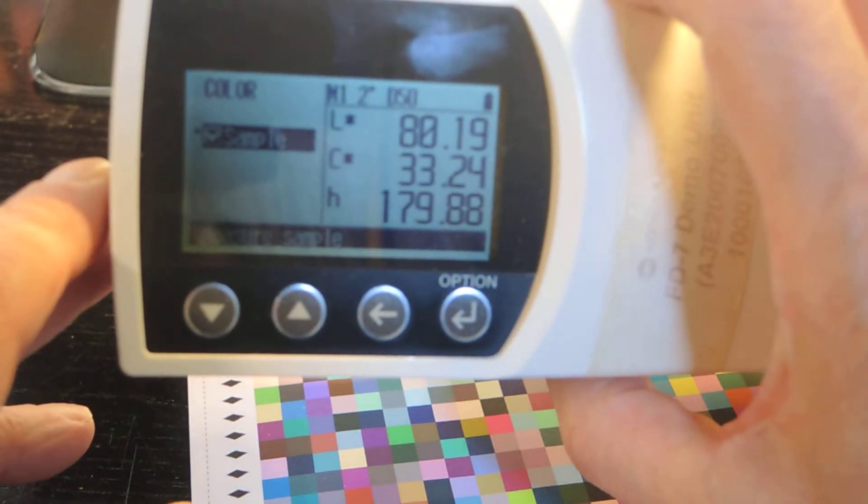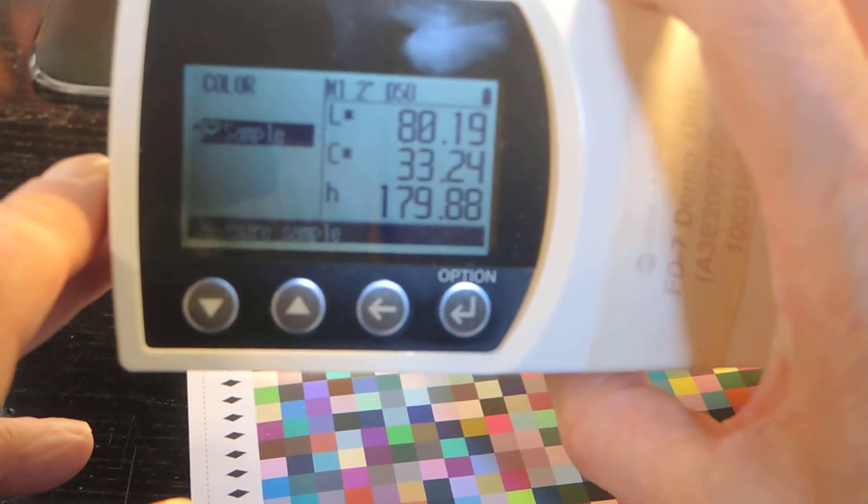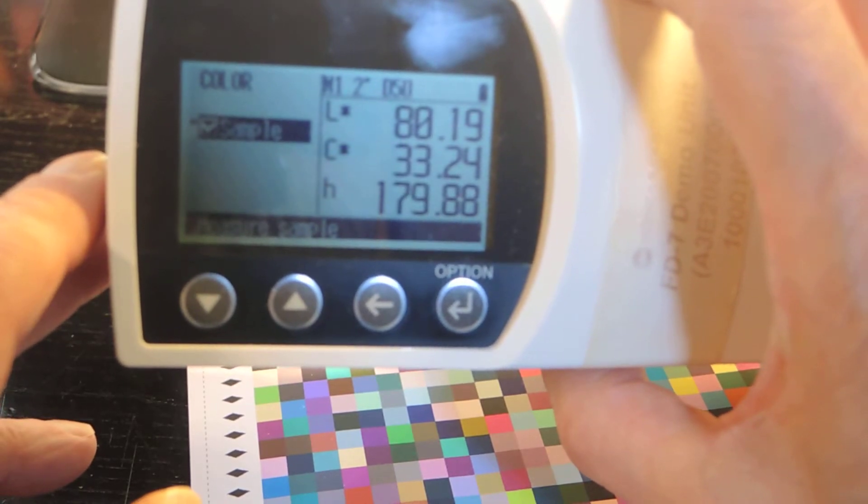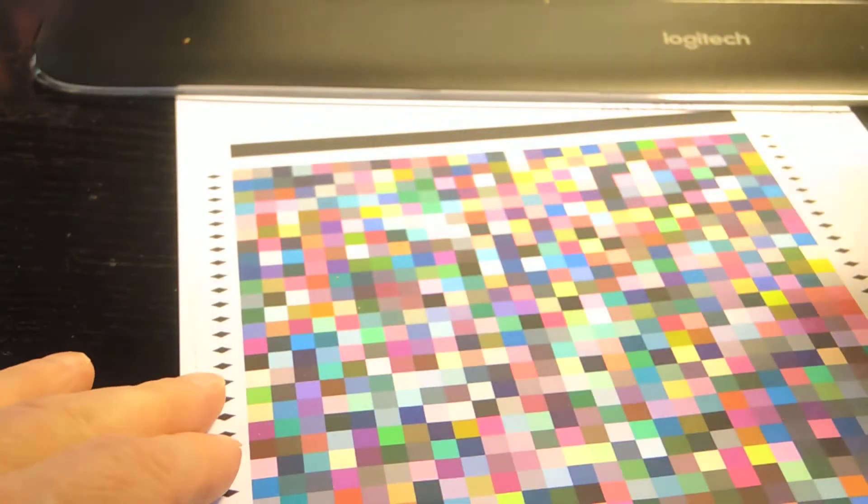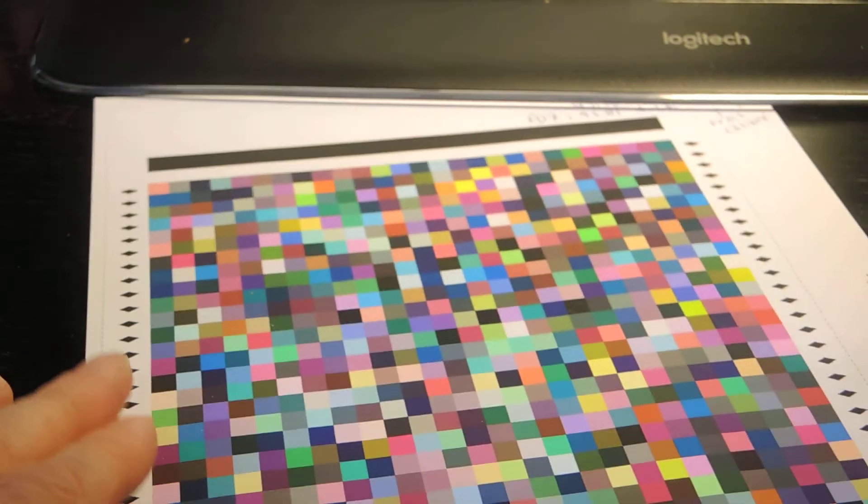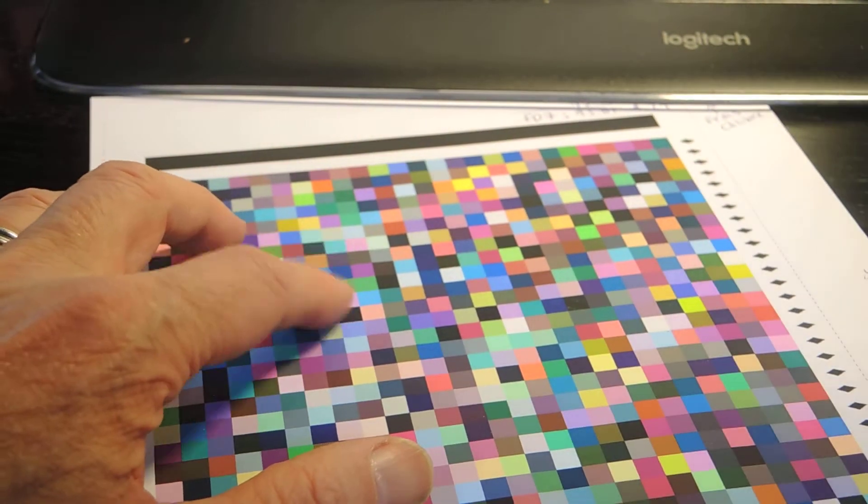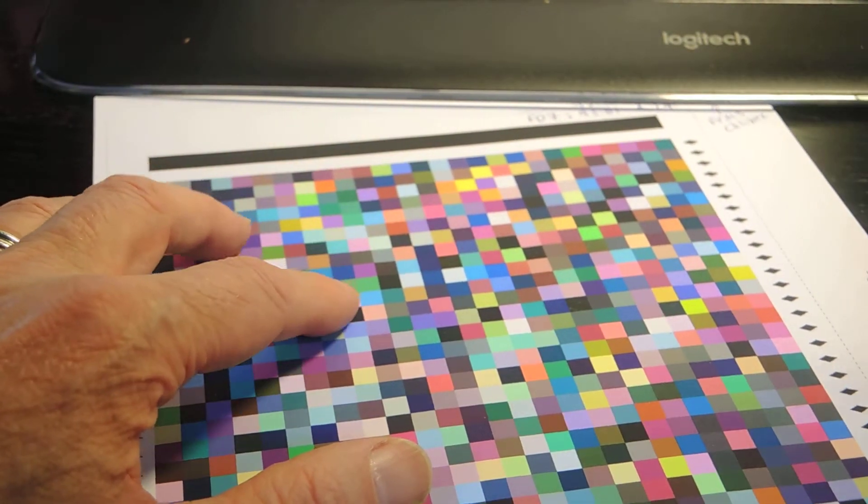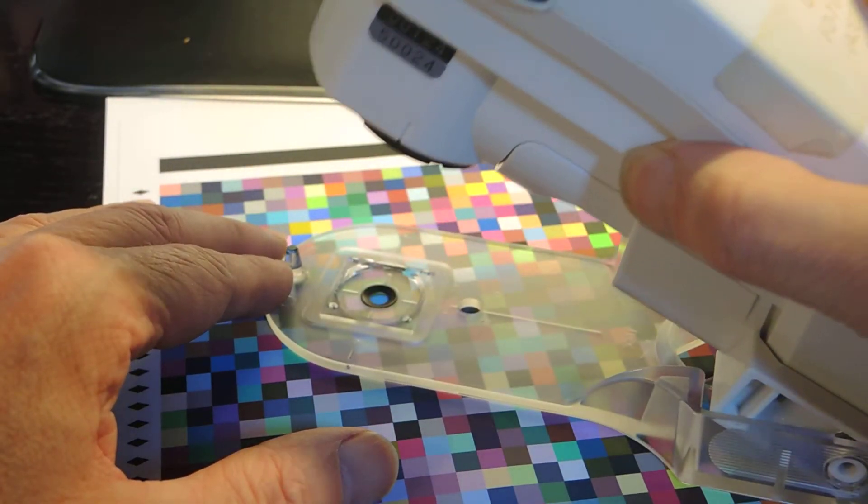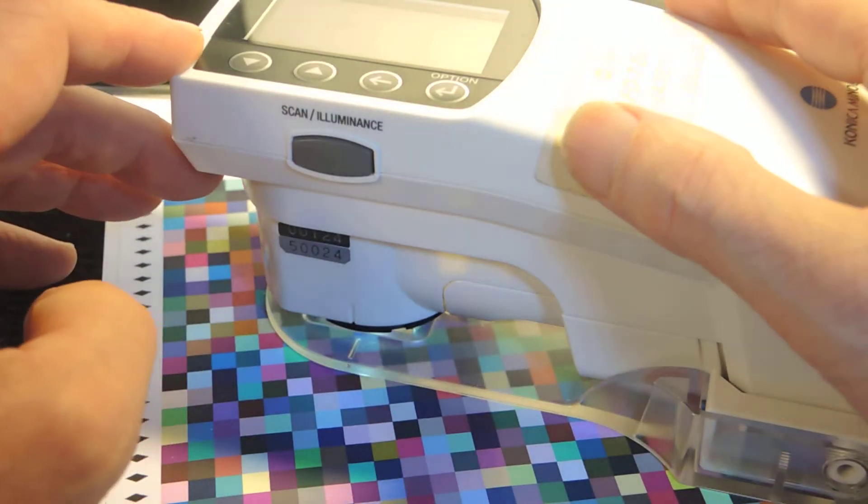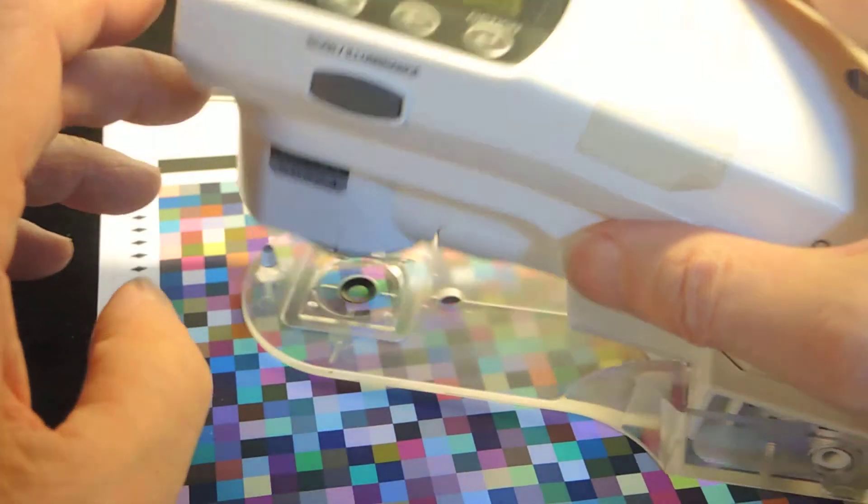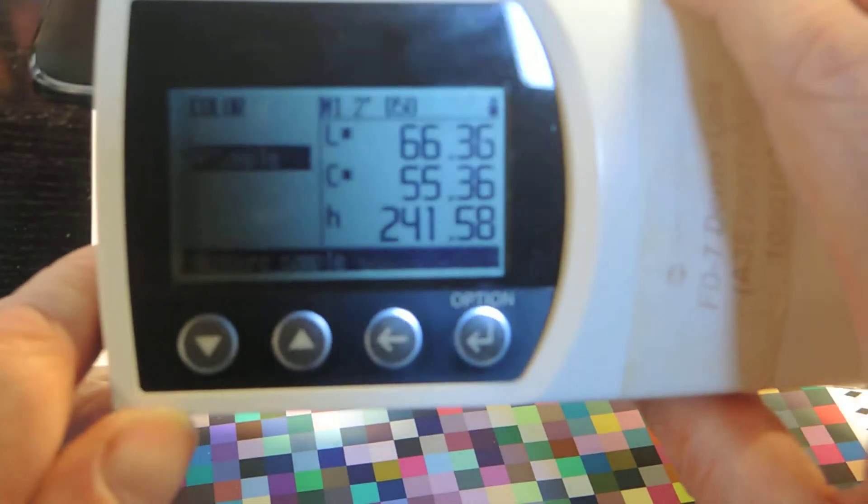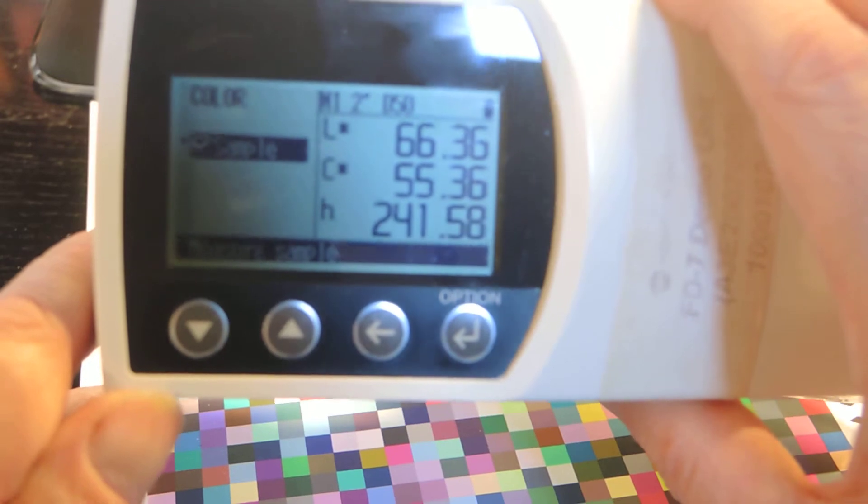That's definitely a green and very close to be turquoise because it's one, it's close to 180. If I find the cyan on this sheet, this would be more cyan. I'm going to have maybe 220 degrees. Let's see, 241 degrees. That's more like what it should be. Okay.